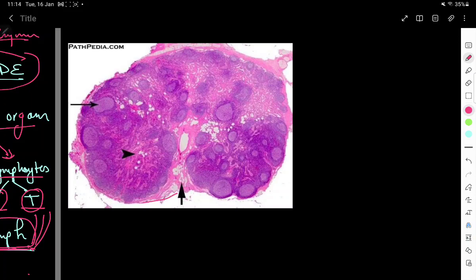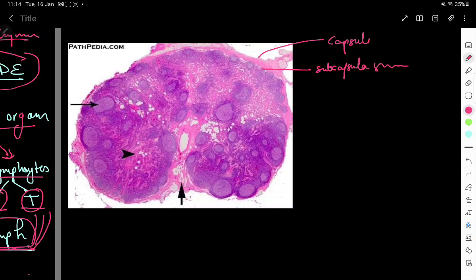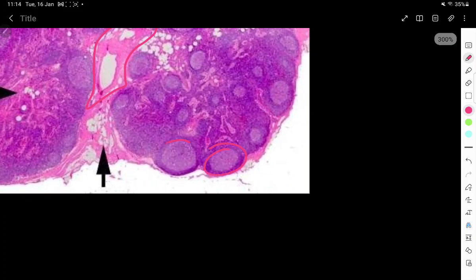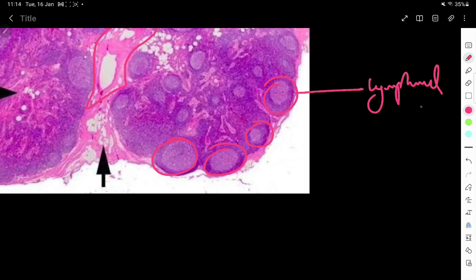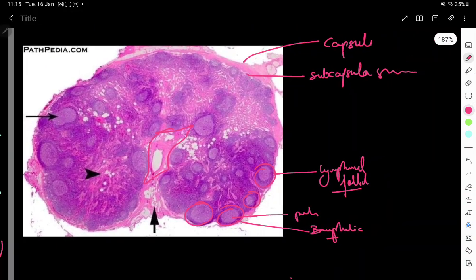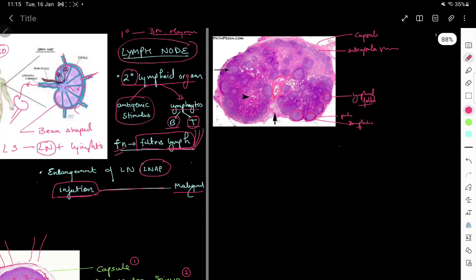Let's label another lymph node. Here we have another bean-shaped structure with a capsule and a subcapsular sinus space visible. This area is part of the medulla. We can see many lymphoid follicles, which are actively dividing — the central area is pale and the peripheral area is more basophilic due to actively dividing cells. The center has the medullary sinus and the surrounding medullary cord. This is the basic histology of the lymph node.